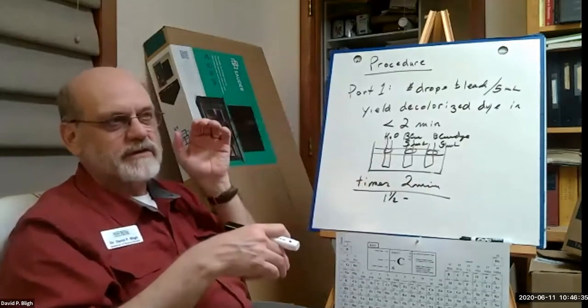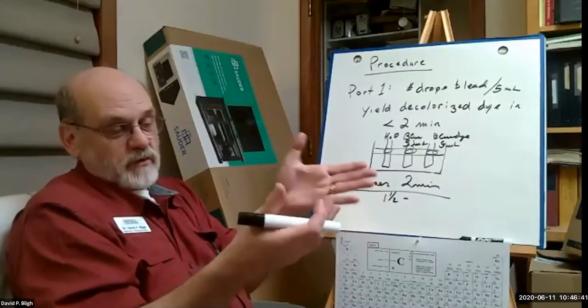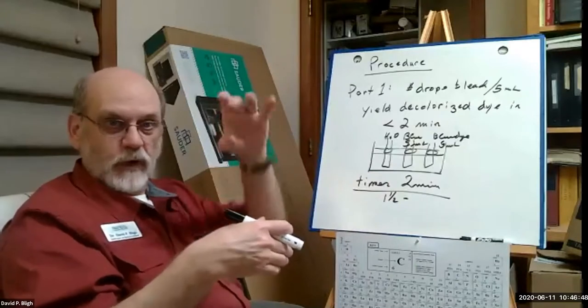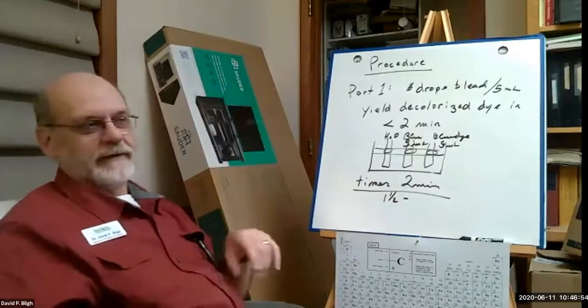So let's say you went to 10 and then 40. Right? So then the logical thing would be, if 40 is too far and 20 is not enough, split the difference. Go halfway, right? Focus in. Focus too far the other way, and then you gradually get closer and closer and closer.